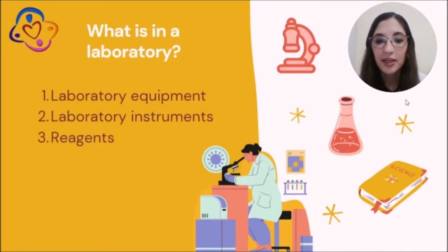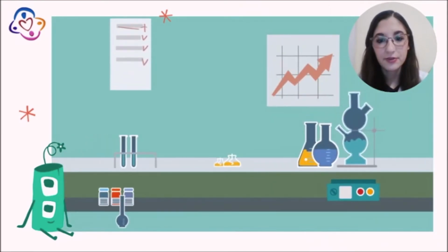Here I can name, for example, the distilled water. This is a kind of water that we all the time have to use to clean our flasks or to mix with a specific substance. Those are called reagents. Now we're going to watch this video.